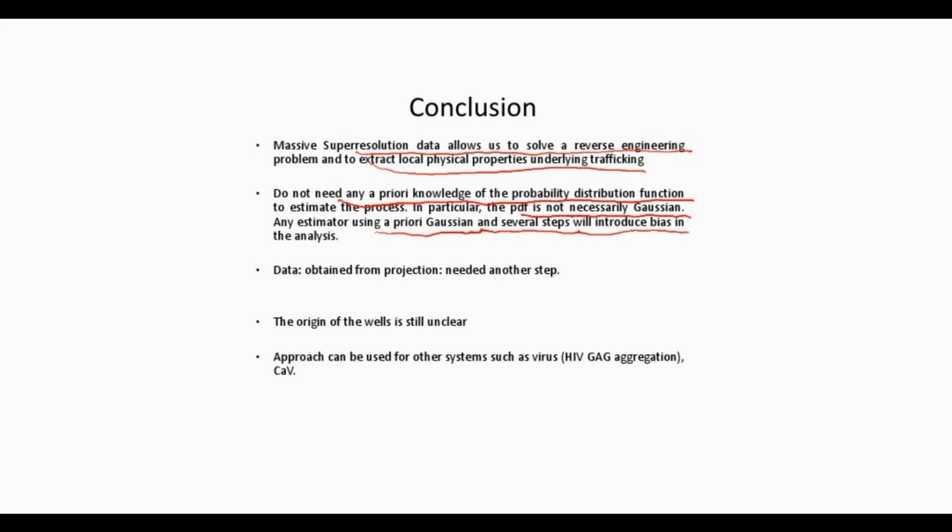There is another problem that we haven't discussed here: usually the data are projected on the focal plane, although they are coming from the surface of a neuron. So there is usually another step needed to remove the drift that is added due to the projection of a stochastic process that happens on the surface of a membrane to the plane. If you have, let's say, a ball and a stochastic process occurring here, and this has to be projected, usually there is an additional component, or a drift, that is coming from the projection. And this will be the subject of a different lecture.